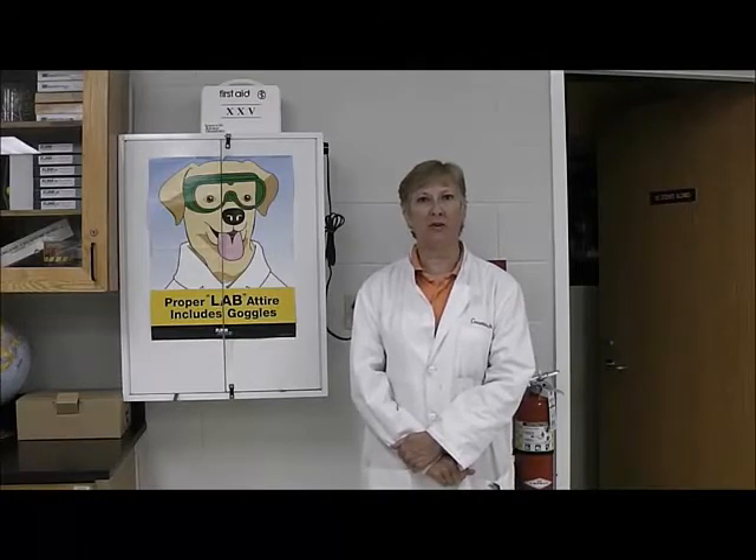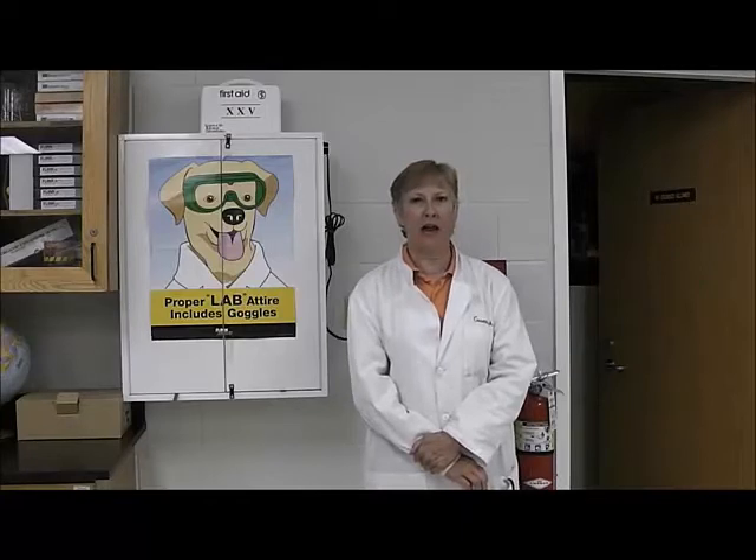What we are going to go through today is some of the safety procedures that you will be working on when you do labs. And the most important one is going to be wearing goggles for every lab you do.